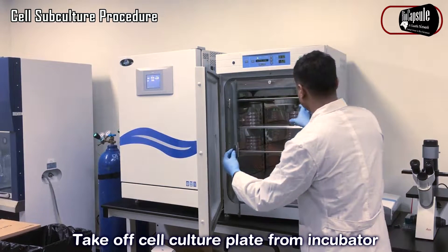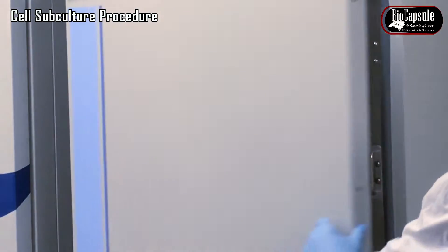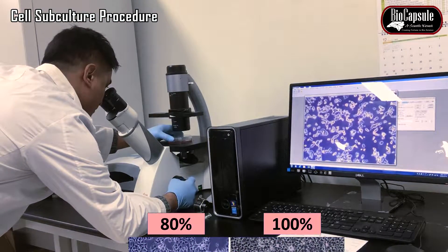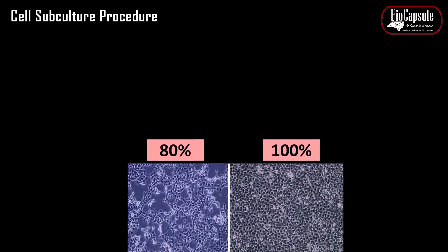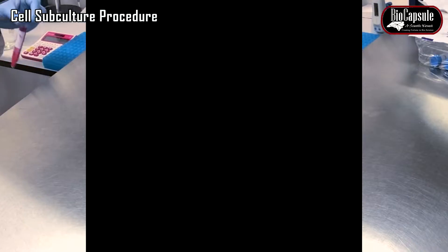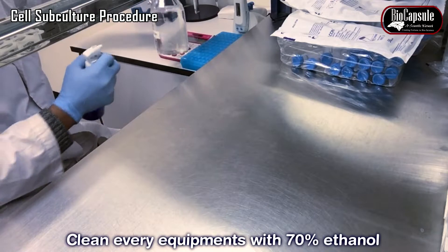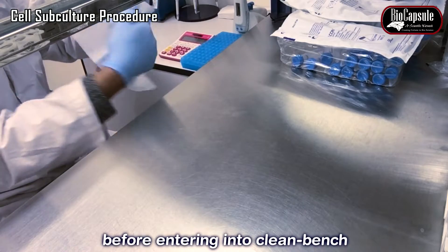Check the cell culture plates from the incubator. The confluence of the cells should be checked under the microscope and cell morphology should be monitored. Depending on the confluence of the cells, we have to decide how many plates we are going to split from one plate. Clean every equipment with 70% ethanol before entering the clean bench.